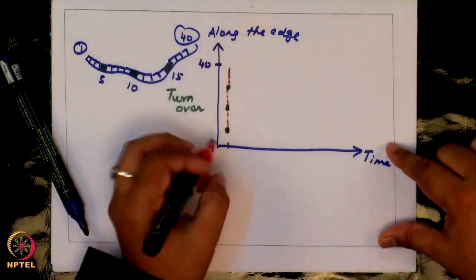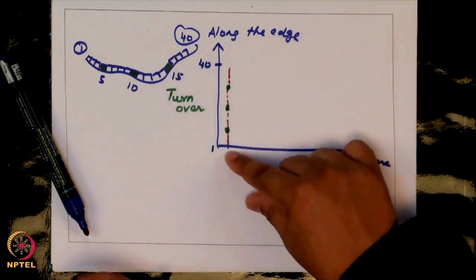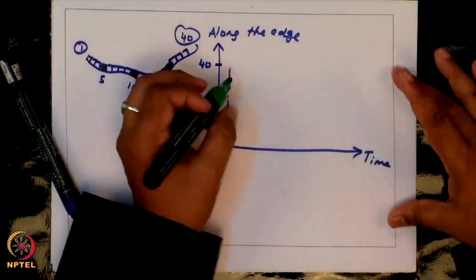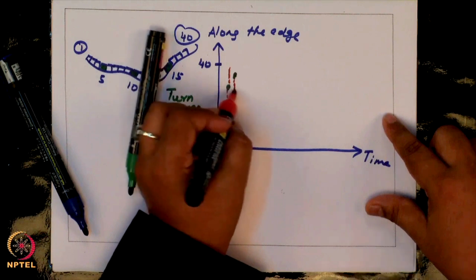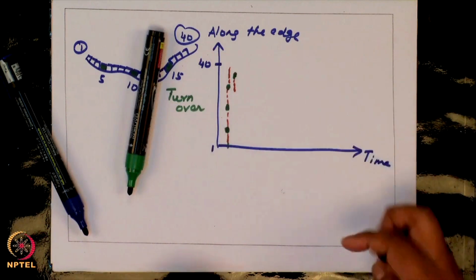This allows you to capture what is happening at this particular time instant along the edge. In the next time instant, in the neighboring point you might see a green here and red here, suggesting a depolymerization event, and so on and so forth.